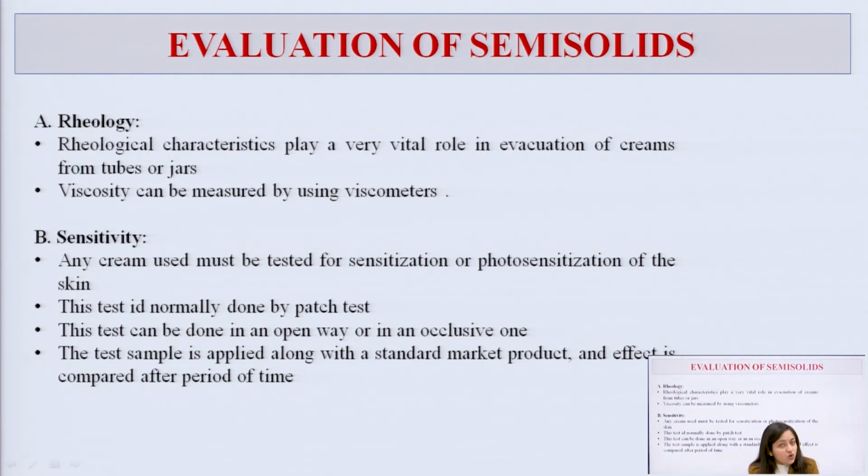As I have discussed already, rheology is a test that helps us to understand the flow properties of the formulation, because through these flow properties it is important for us to understand the evacuation of the creams. Evacuation means that creams are usually supplied in a collapsible tube. If you apply pressure on one side of the collapsible tube, the creams are evacuated from the other side of the tube.